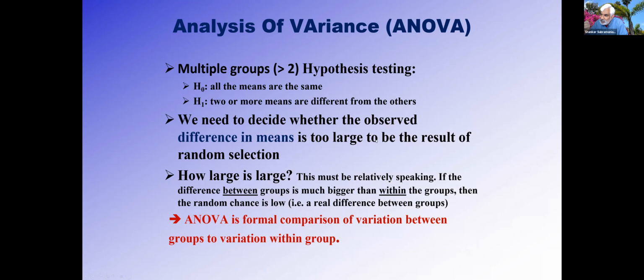I'm going to give you just a couple more tools before I walk you through examples. Analysis of variance. Imagine I have many factors. I have the factor gender, I have genetic background, I have treatment and no treatment, I have time. Say I have 4 factors. Now, which factor is important? Which factor has a significant p-value for my lipid? Which factor is not important?